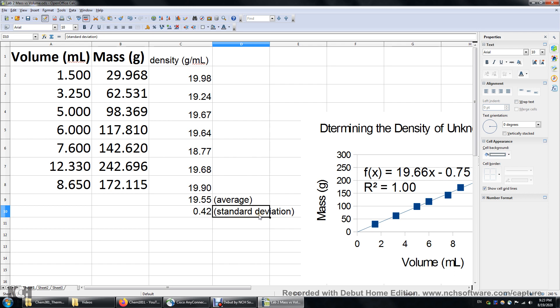The standard deviation tells us something about the precision. The average, we'll have to compare the average with the literature value to understand the accuracy of our data. Assuming this metal is gold, gold has a density of 19.3 grams per milliliter. So in this case we have a fairly high accuracy and a fairly good precision. So both are pretty good.